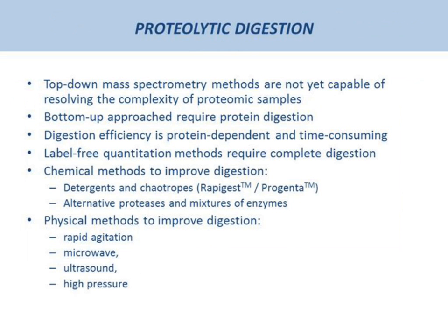Challenges with proteomic sample preparations are not limited to protein dissolution and enrichment. The next step is proteolytic digestion, typically performed by site-specific serine proteases such as trypsin and the proteinase Lys-C, and several other enzymes, or their combinations. The digestion step typically takes a long time, as the enzyme is expected to quantitatively cleave all possible sites on all substrate proteins. However, the reality is far from ideal. Digestion kinetics is substrate protein specific. Therefore, the digestion step becomes a time-consuming process. Moreover, some proteins are very resistant to proteases and therefore may escape complete digestion by conventional proteomic methods.